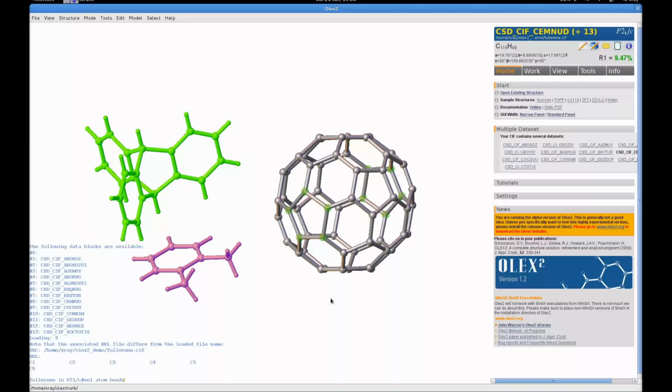And hopefully you can see this in the command line. I'm using the command sel atom bonds, and now all the atoms and bonds are selected, and again I can use the up arrow just to jump to that group, and I can give it a different group this time. I can say group 3, and we get a different set of colors.